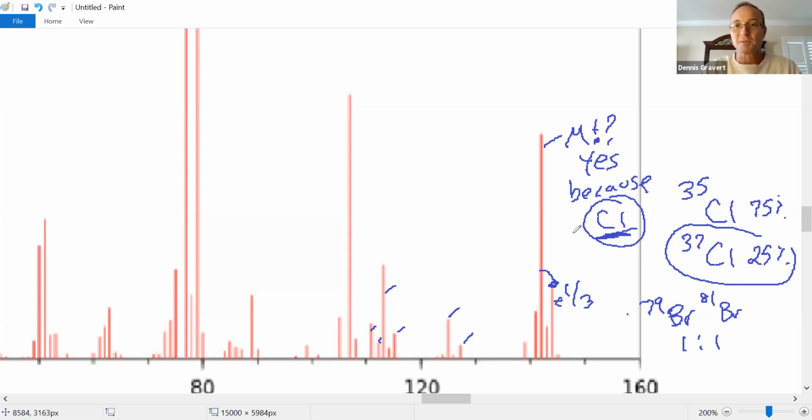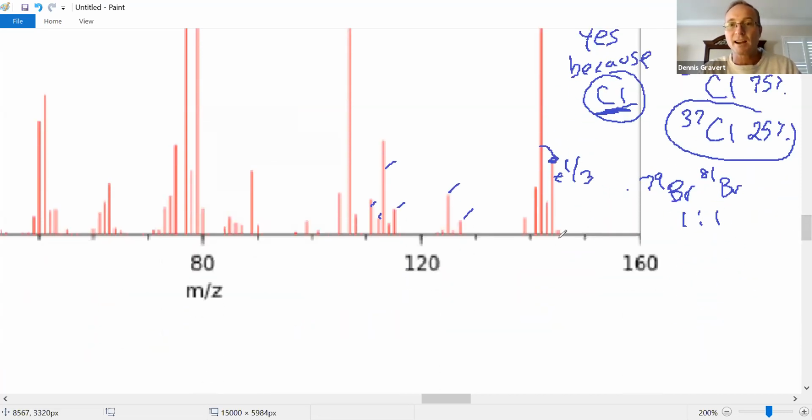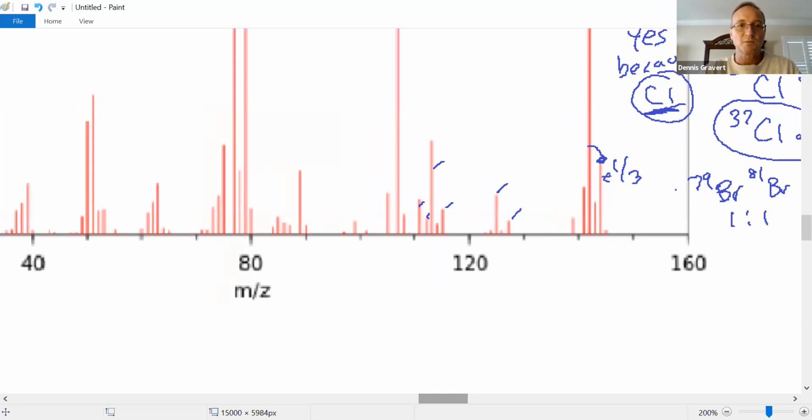All right, let's get a measurement of that value. So it's that big peak right there. Let's go find, ooh, here's a bunch of peaks all clustered together. So what's the width of one? Well, 40 to 80, this little tick mark must be 60. This one looks like 70, and then 70, 80.